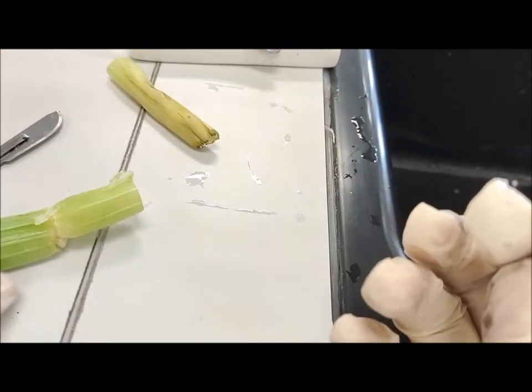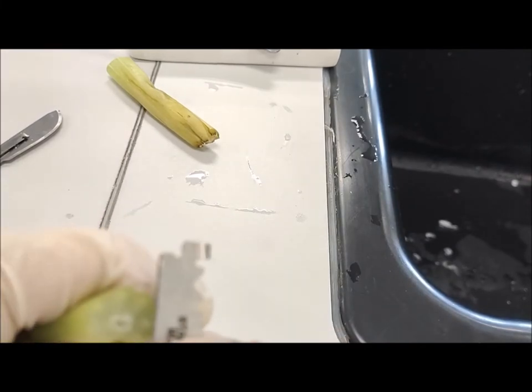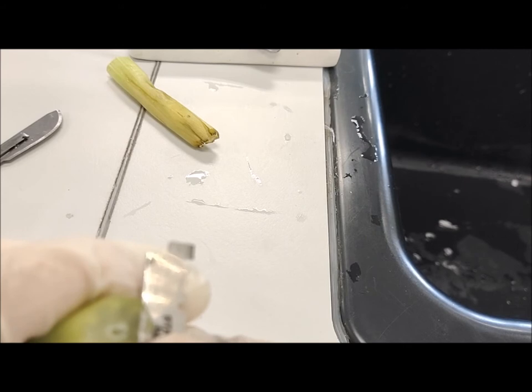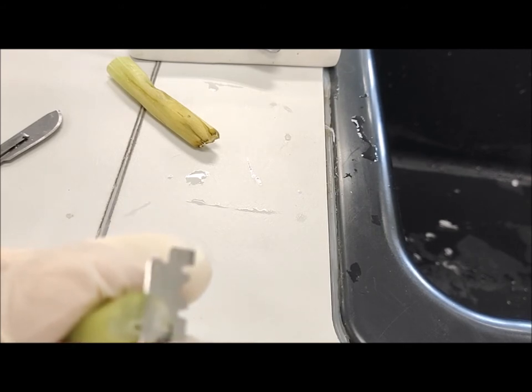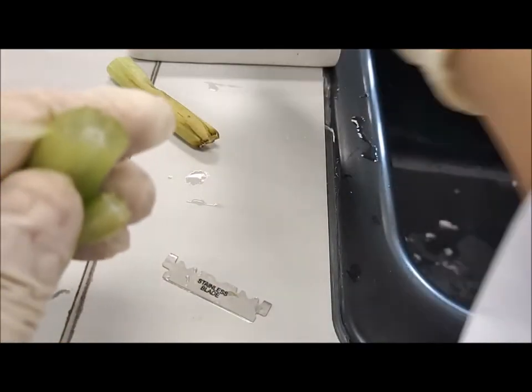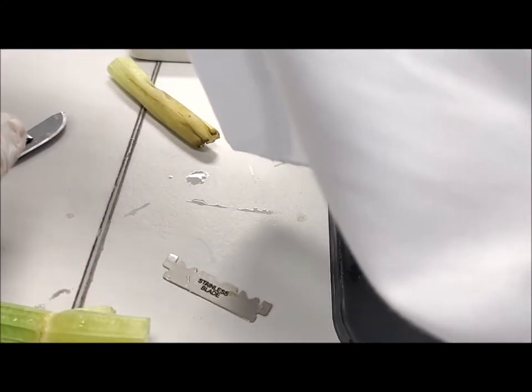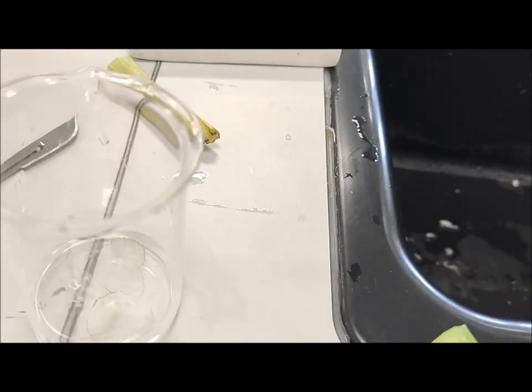I try again — I think this is a very good one, not bad. I place it inside the beaker immediately and try to take another one. I think it's enough, so I place this one back.